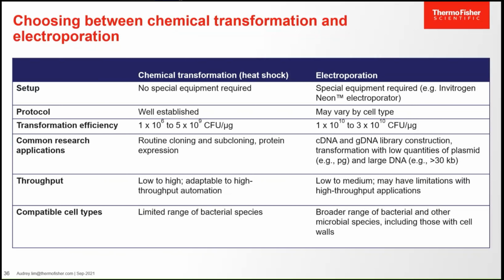Okay, just to share, I tried both of these before. Electroporation, if you succeed, then you can really get a lot of bacterial cells. But if you fail, it's quite difficult. You will get a plain plate. Okay, so it is easier to get a commercial one.